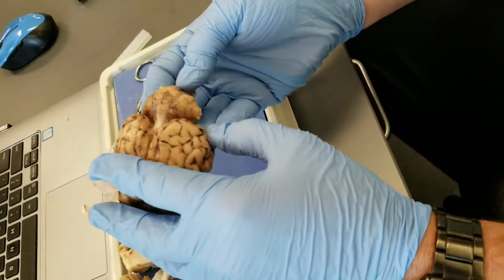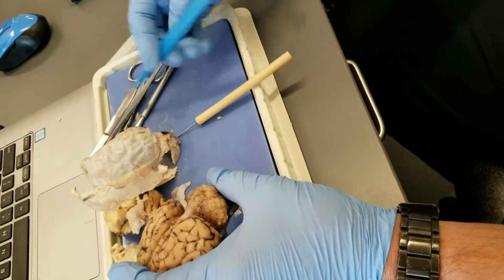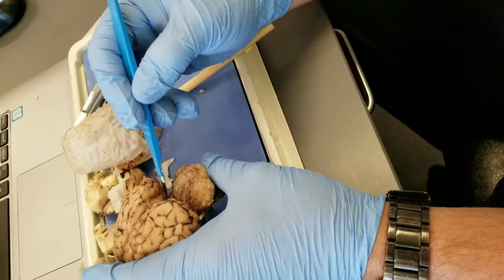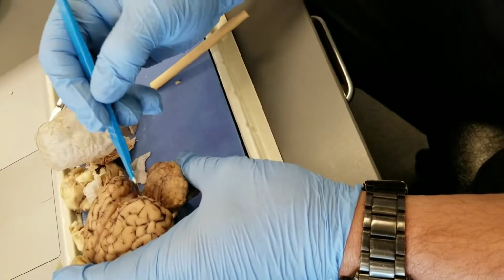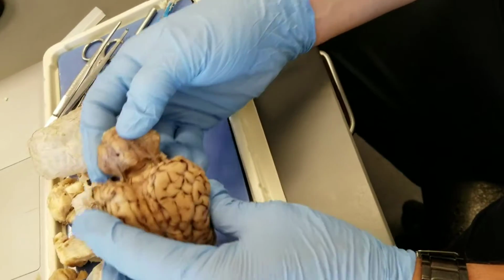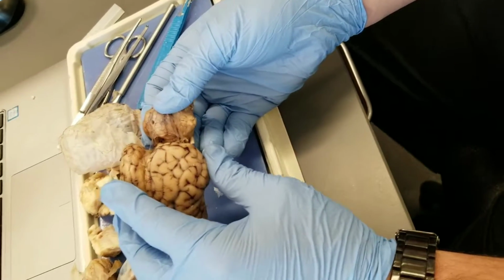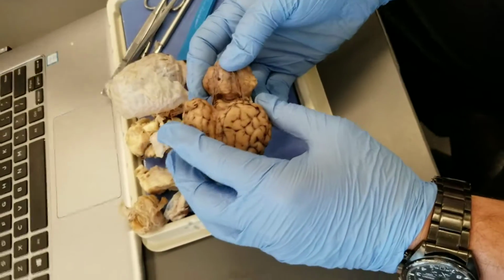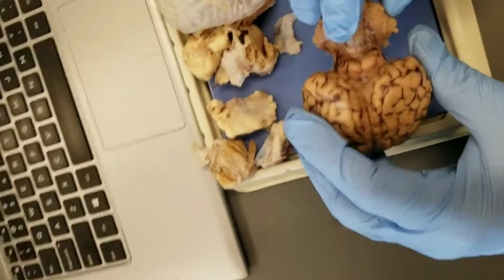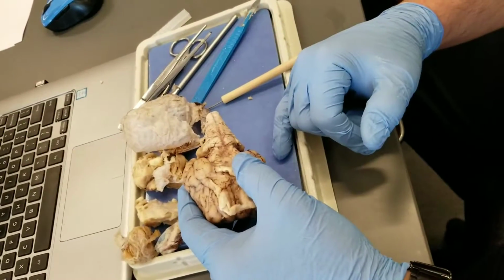Okay. So if we reflect this down a little bit, and I've got to cut that arachnoid matter out of the way. Then we should see some little... I know it's crude, but they kind of look like butt cheeks, like somebody's mooning you. If we tip that down, you get those lumps there, right? Can you see that? Is that the insula? No, that's not the insula. That's the tectum, the corpora quadrigemina, made out of the inferior and superior colliculi. So that we know is the roof of the midbrain. So that's the midbrain there. Okay. So midbrain, pons, medulla oblongata.